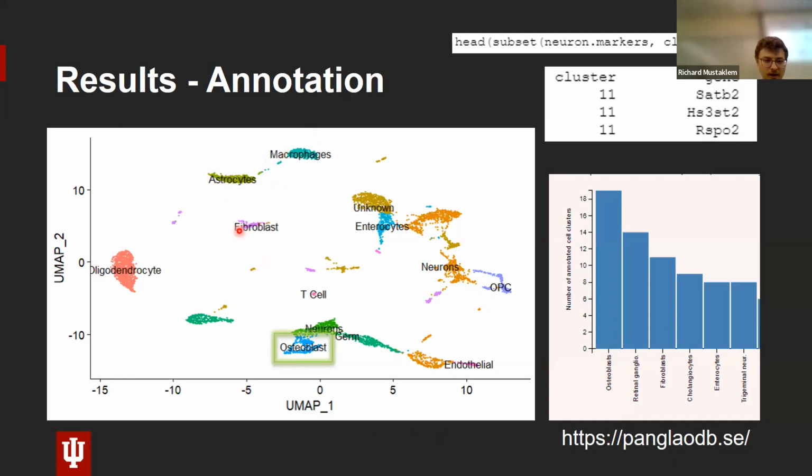And another thing too, fibroblasts, they're completely isolated from everything. T cells completely isolated, but then you have these two giant groups here. You know, this group and this group. So you can draw inferences from this graph. And just to reiterate, this is a small data set. So some of the conclusions might not be too powerful, but as long as you're understanding the concept behind single cell, this is kind of what it's all about.